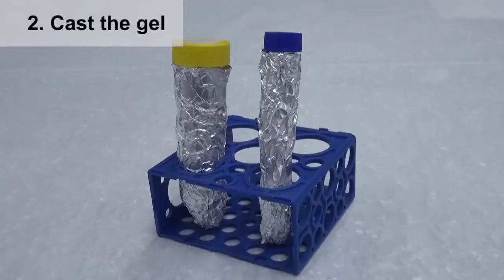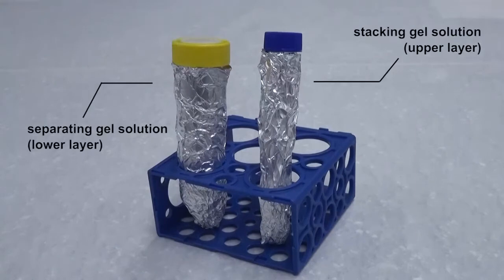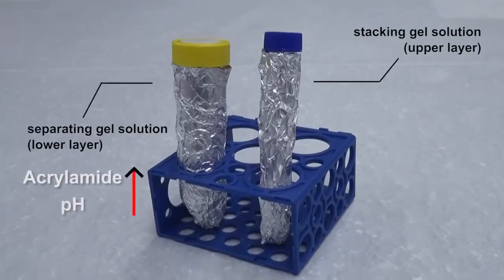The gel used in this experiment has two layers. The composition and pH are different for the upper and lower layers. Hence its name, discontinuous gel electrophoresis system. The lower layer has a higher acrylamide concentration and pH value than the upper layer. Do not switch them.